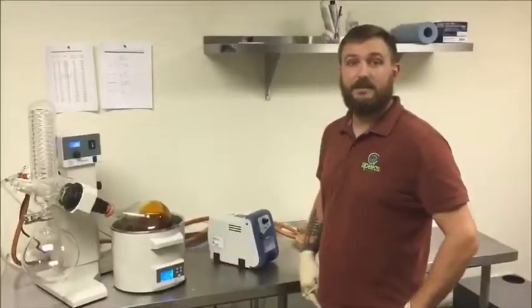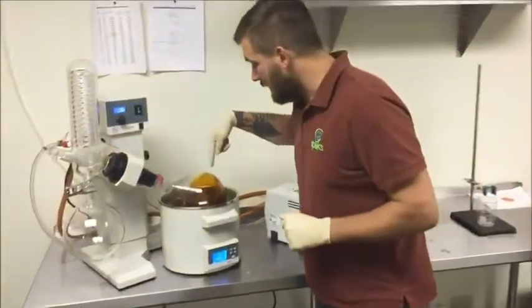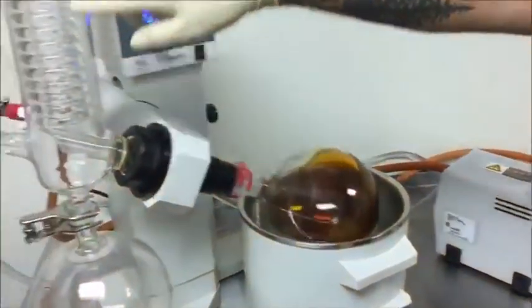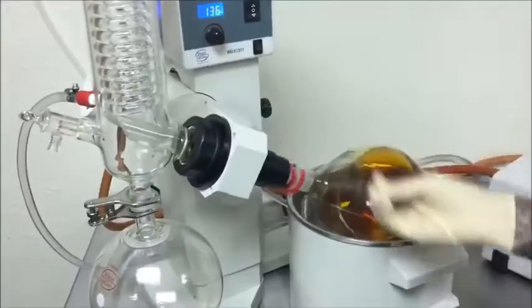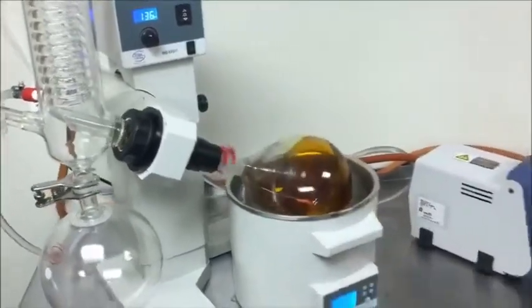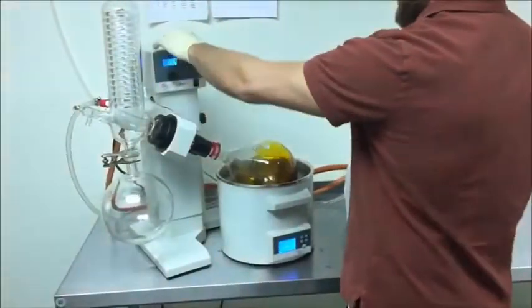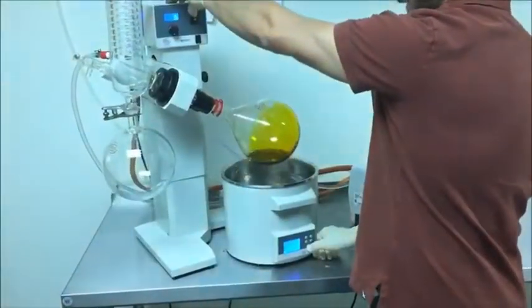Here we are at the end of our distillation. If you come over here, you can see that all we have left in this flask is the oil. There's no more dripping over here on our coils, which means the ethanol is done distilling over. So what we're going to do, turn off our vacuum pump, stop the rotation, lift this up, turn off our hot water bath.